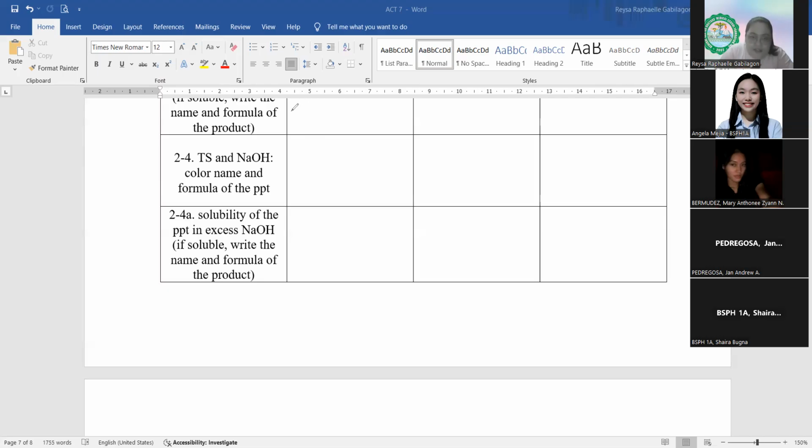You will have silver nitrate plus NaOH. Exchange partners pa rin yan sila, class. So, AgOH pa rin. Pero this time, instead of ammonium nitrate, it's sodium nitrate. So, yung precipitate dyan, parehas pa rin. Kopyahin nyo na lang yung nasa taas, ha? Parehas lang yan sila.